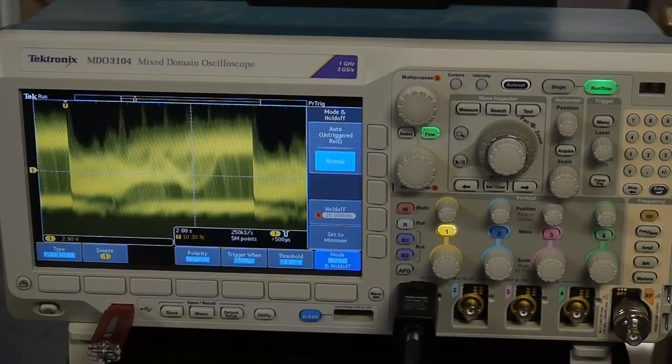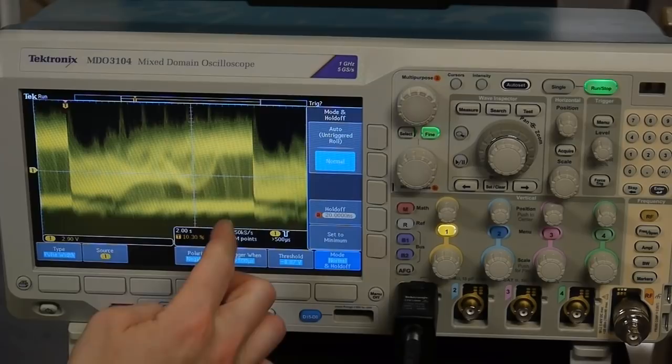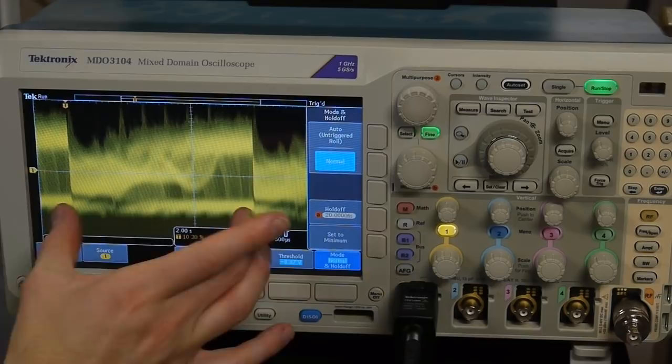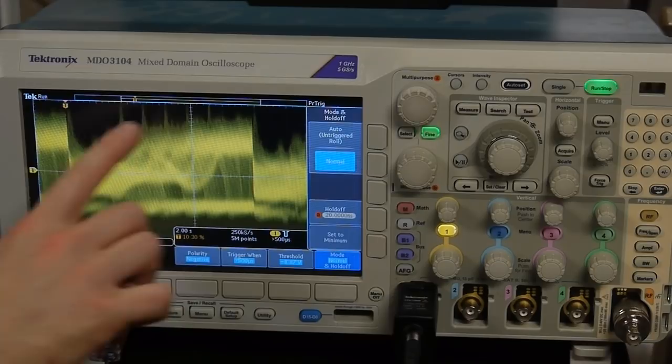So there it is. This is a whole video frame. You can actually see the divisions. This is the start of the next frame. This is the end of the previous frame, and this is the whole frame. As you can see, there might be just a few very sparse peaks that are actually going off scale. But otherwise, it's a very good image because we're using as much dynamic range as we can.